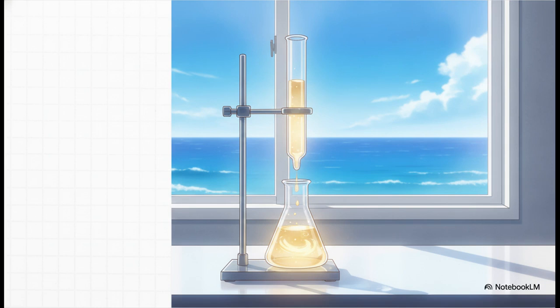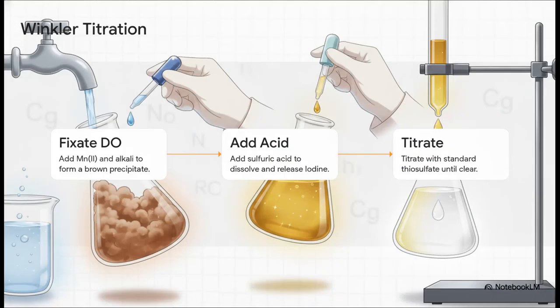This highly precise chemical method was originally developed all the way back in 1888, which is incredible history. And, honestly, over a century later, it remarkably remains a gold standard. In fact, it is still the preferred method for assaying precise oceanic levels of oxygen in uncontaminated seawater. It relies entirely on chemical reactions rather than electronic signals. This is where that experimental, detailed video presented by Dr. Chem really shines, showing us this exact lab-style walkthrough.